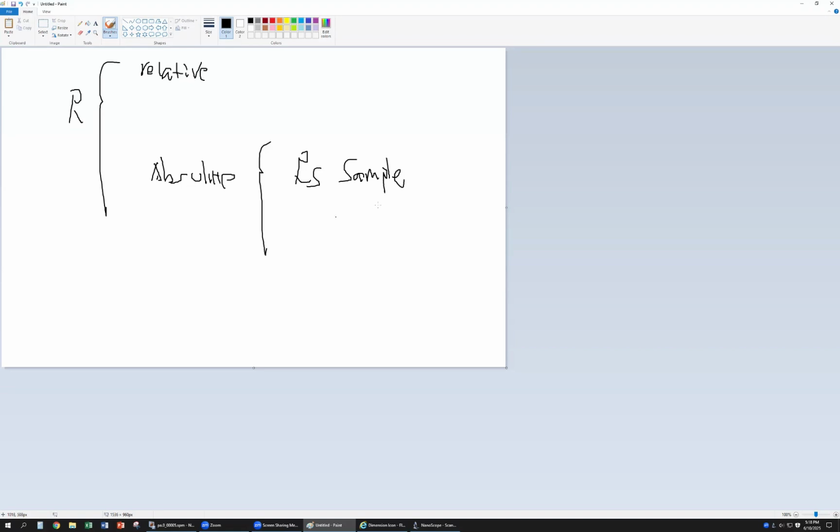This sample is quite hard. When you scan this sample, the scan area is 3 micron by 3 micron, or a 3 by 2 micron image. When you scan this sample, you can use PeakForce QNM, or even the tapping module. Collect this image.